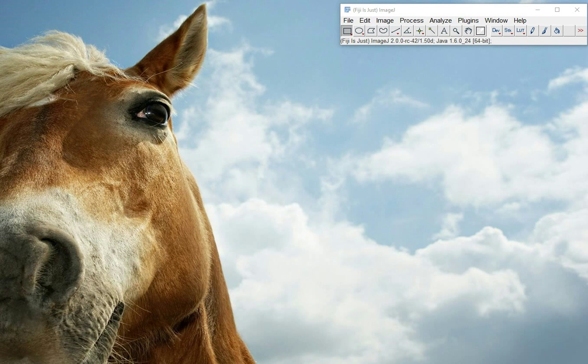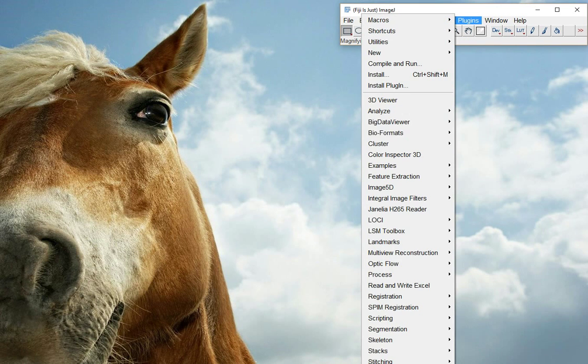Hello, this is a quick tutorial on how to use the Read&Write Excel plugin for ImageJ and Fiji.